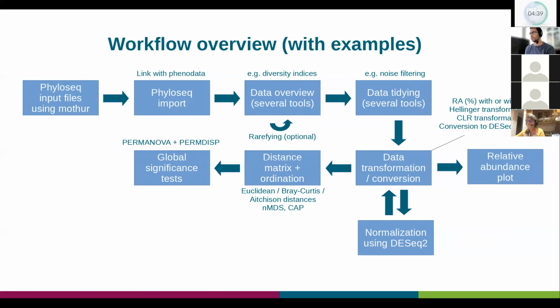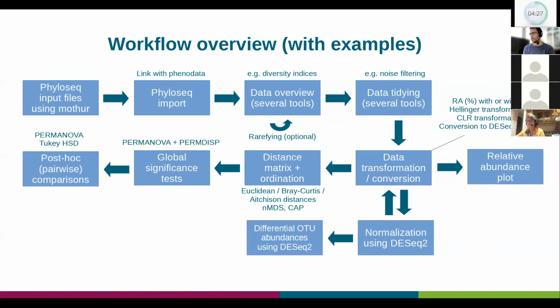And if we want to compare communities, then we have the significance tests like PERMANOVA, PERMDISP, and then post hoc tests, so Tukey's honest significant difference test. On top of that, there's the DESeq2 test for comparing taxon abundances.